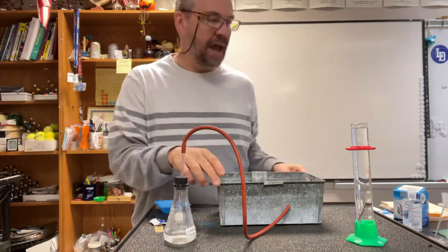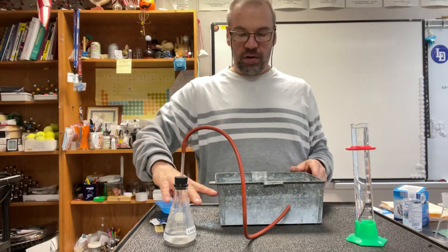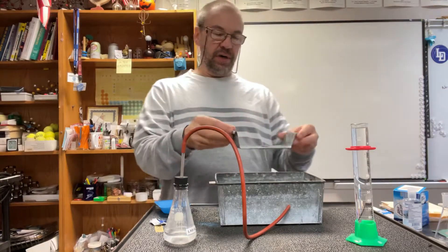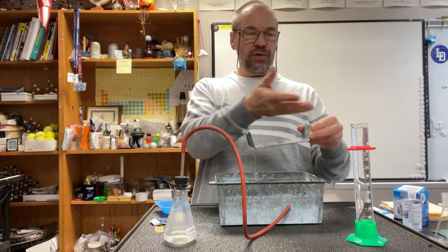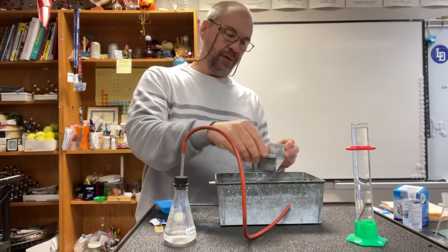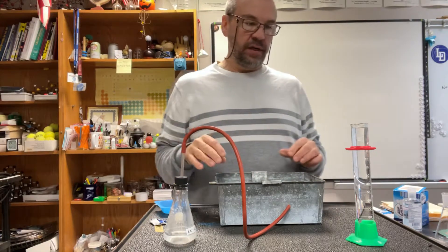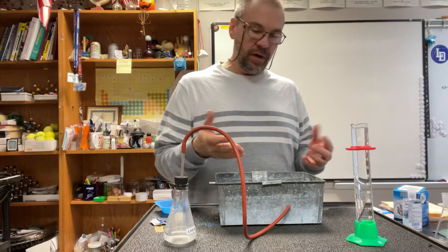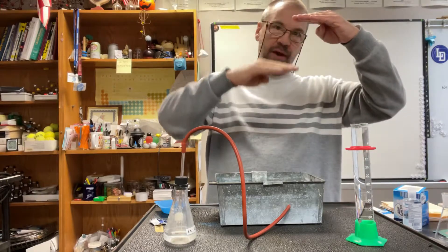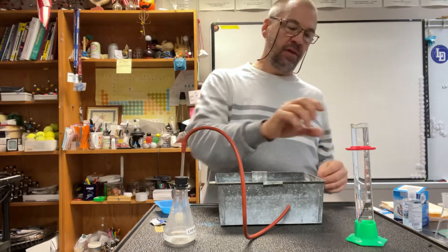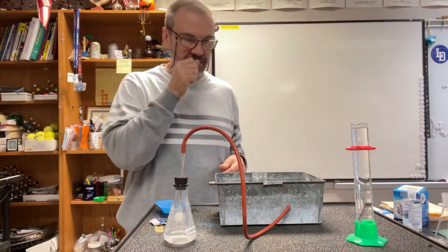Now in our pan here, the water is filled up right above our centerpiece, so when we invert the graduated cylinder, it's going to be submerged in water. So any gas that enters this tube will push that water out of the tube, and we'll collect the gas in the graduated cylinder.